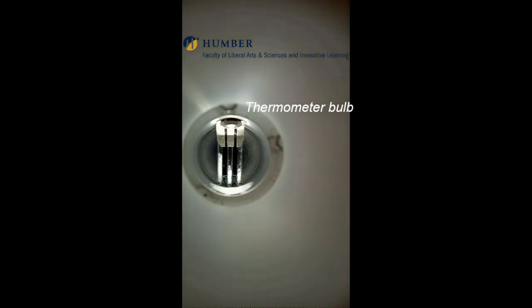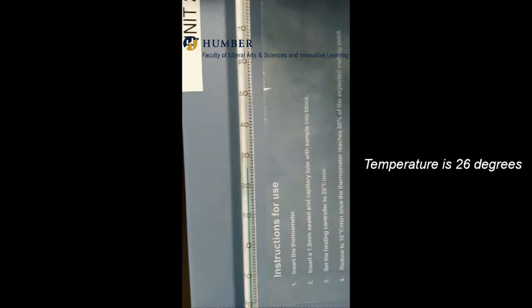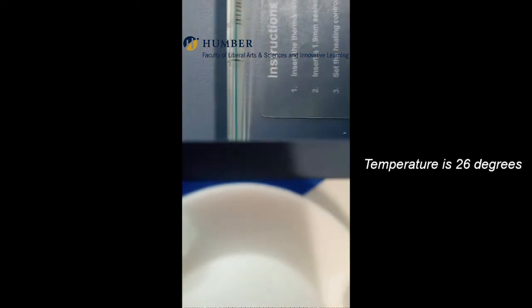Place the thermometer. This is the thermometer bulb. Place the thermometer bulb down. Prior to heating, check the temperature, showing it to be 26 degrees centigrade.